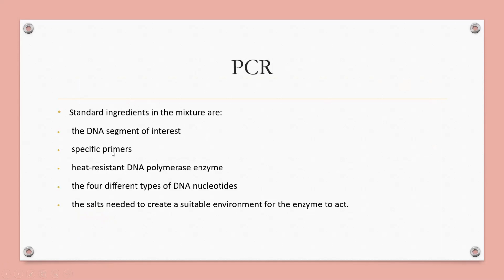Ingredients. First, the DNA segments of interest. This is the target DNA fragment. In general, the shorter the sequence of target DNA, the better it can be used. Next, specific primers.